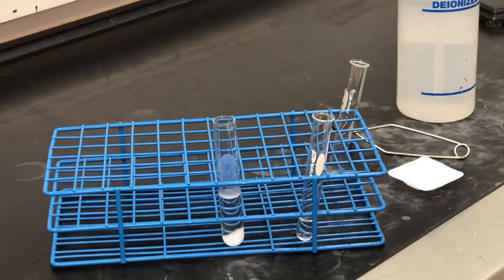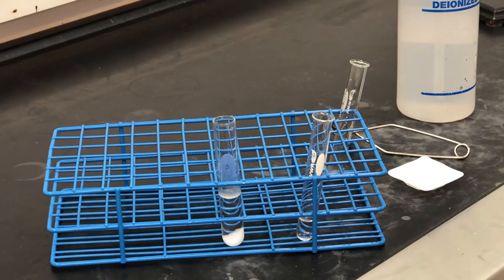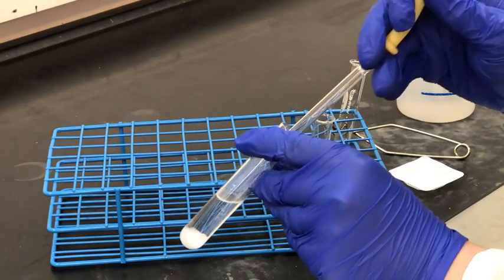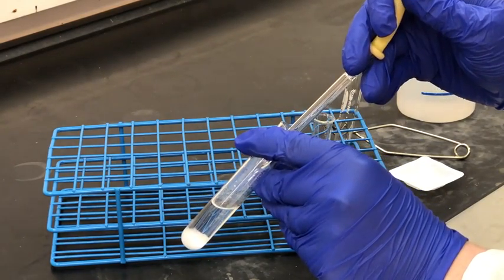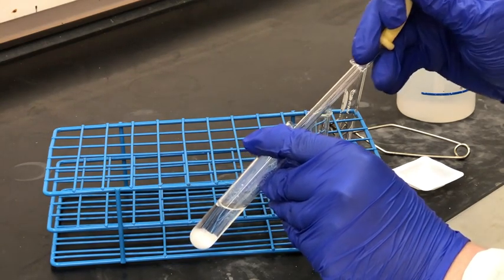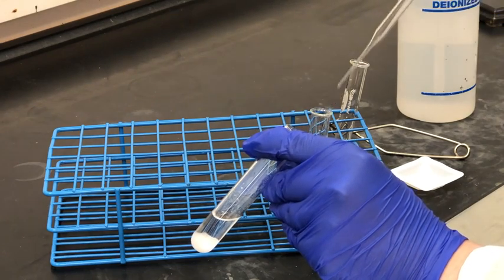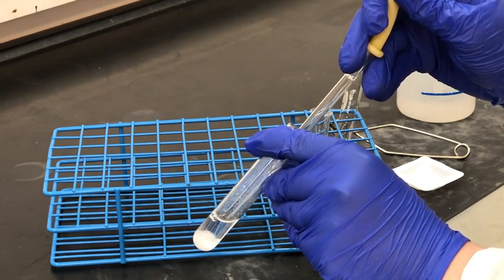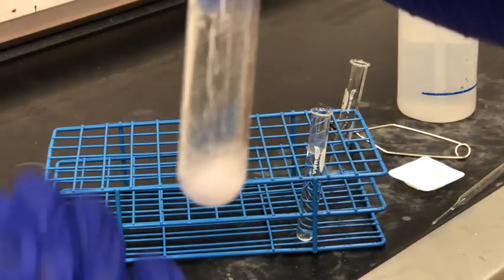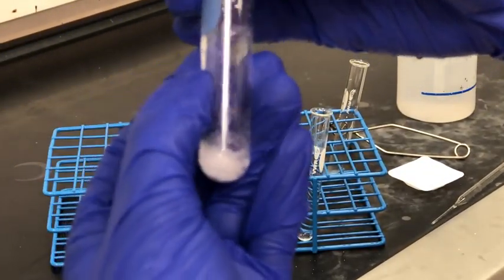Once again we're going to separate the liquid from the solid using a pipette — another form of decanting. We'll place our pipette into the solution, draw out any liquid, and then dispose of it. But remember to keep track of our flow chart: which step are we on, what is the solid, and what is in the liquid? Once we're done decanting we have just the solid remaining in the test tube.